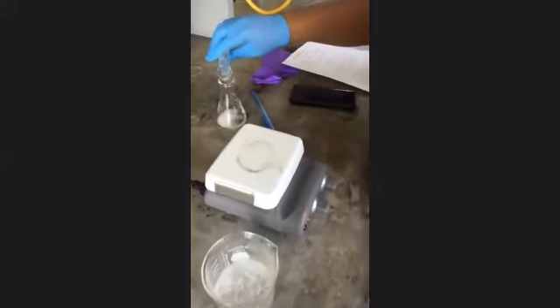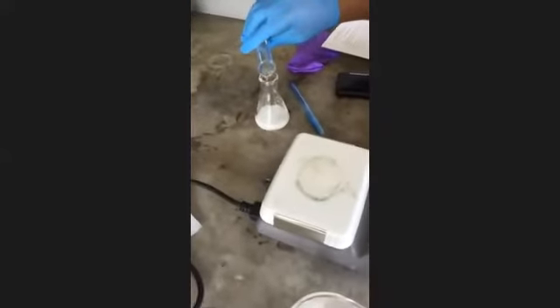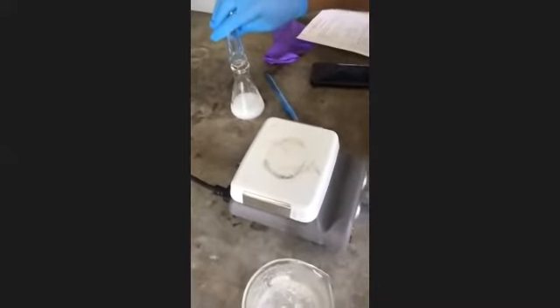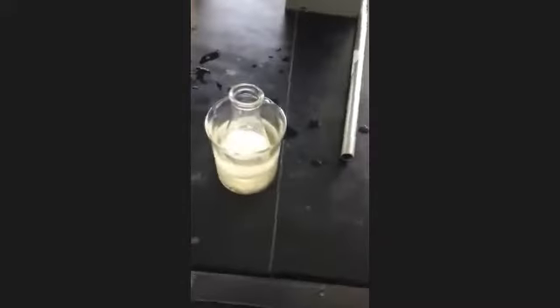And again, you see it turn white and milky. That's that aspirin coming out of solution, again, because it's insoluble in water. Those aspirin pills that you take, those are not just aspirin. They've got all kinds of starches and binders in them. So when you take them, they don't fall apart. But when it gets down into your stomach, all those binders start dissolving with your stomach acid. And that's how the aspirin itself is released.